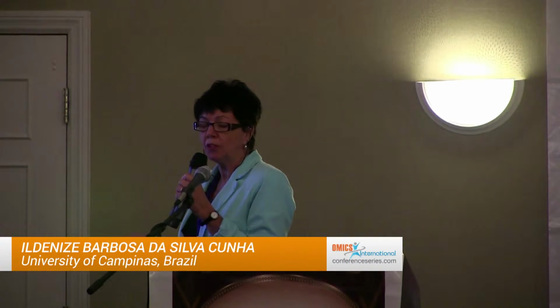After this, we have the ionization source, which depends on the sample and the substance that you have. There are a lot of types of ionization source. Then we have the analyzer, in different ways depending on the purpose, and then the detector. This part is in high vacuum, and the new technologies are growing in these two parts, ionization source and analyzer.